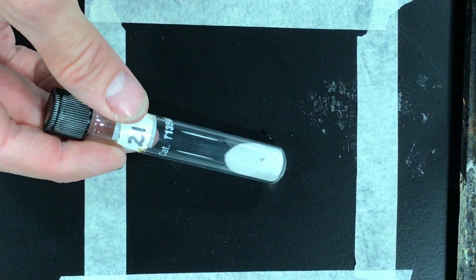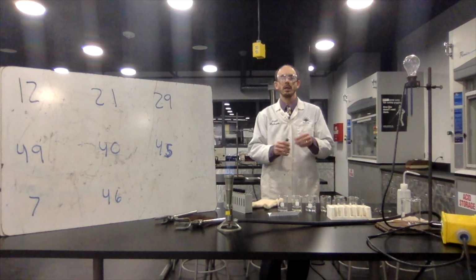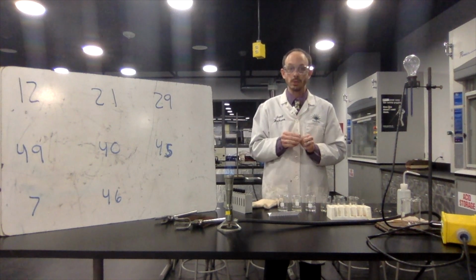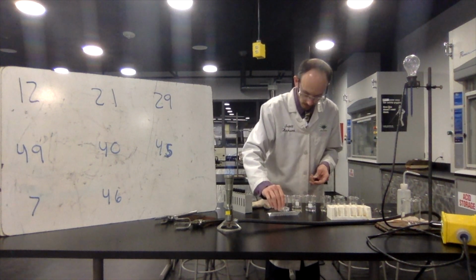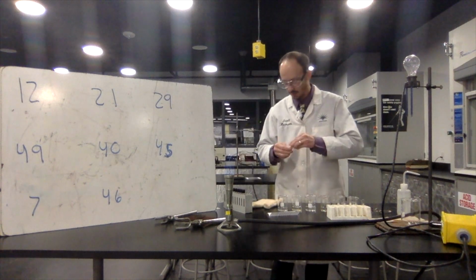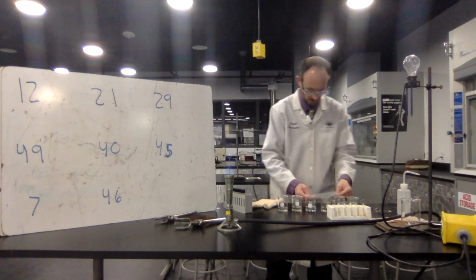So first, there is that material. Okay. And I'm going to open it up and waft it. No discernible scent. I'm going to pour it across there. And then I will show you that. Okay, so we got a nice thin line right across there of that whitish, tannish material.